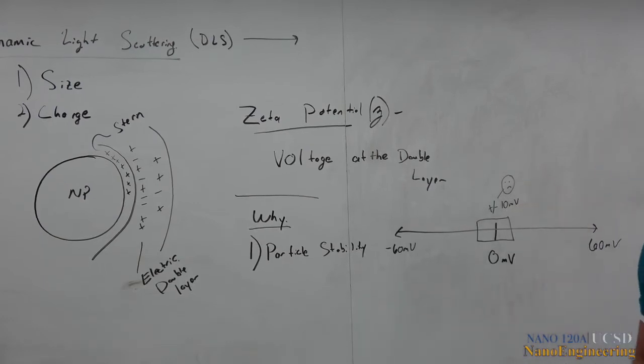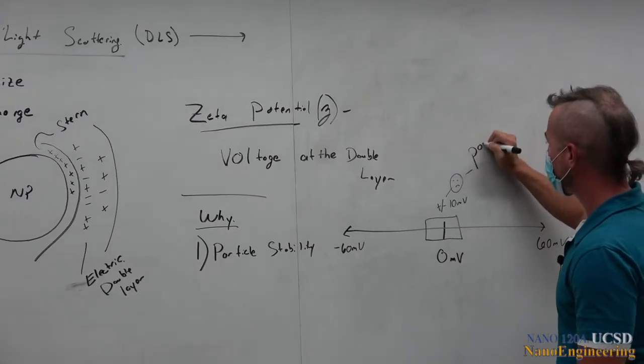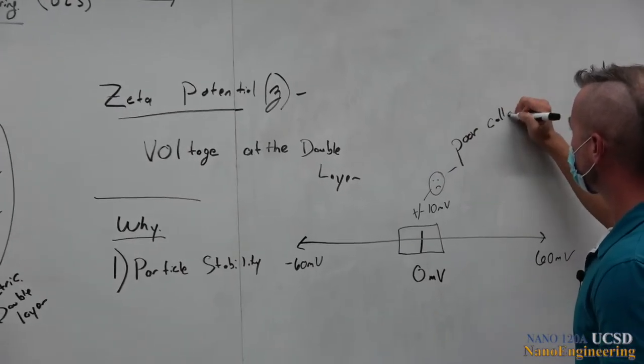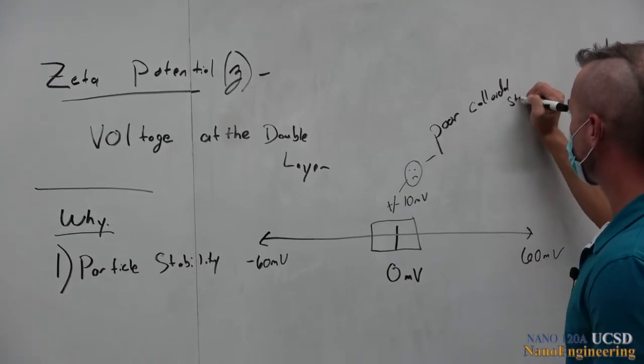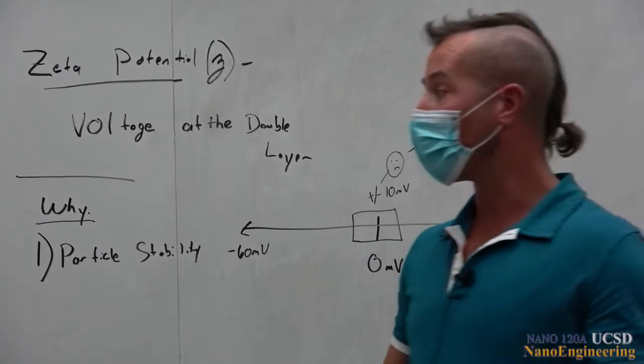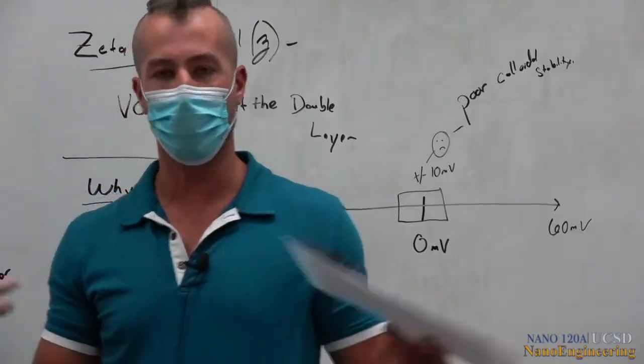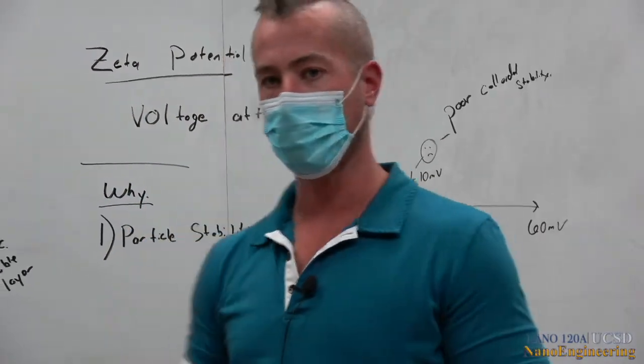That has pretty poor colloidal stability, right? Because at this point, there's relatively little charge repulsing these particles.